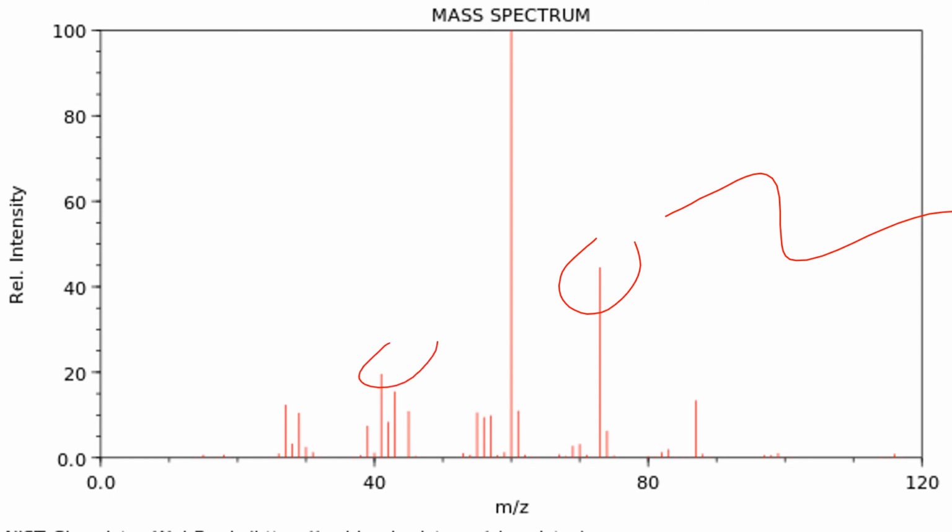On the assessment, you will not have to identify every peak, or indeed all of them, or indeed many of them rather. You will need to identify 3 or 4 that match up to likely fragments from the molecule that you're working towards. You will not be able to identify the molecule from this graph alone. You will need to use it in conjunction with the IR and 13C NMR that we will be covering over the next couple of weeks.